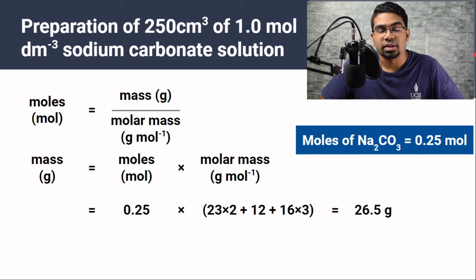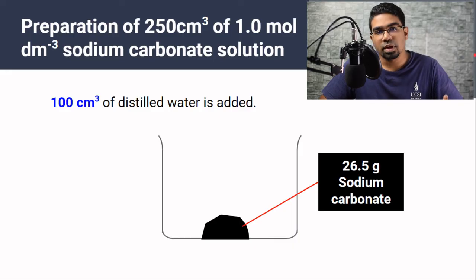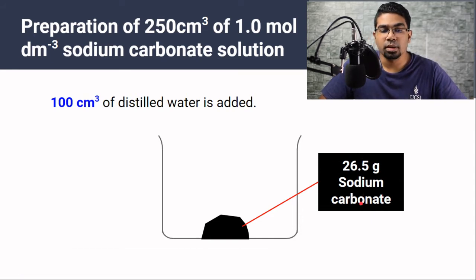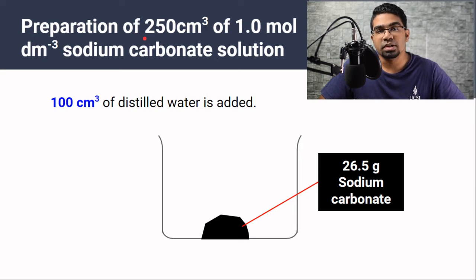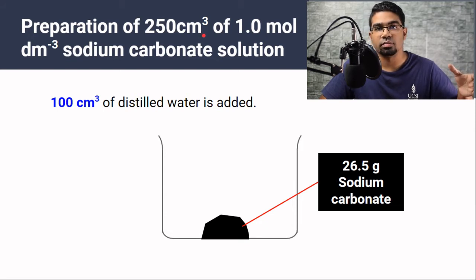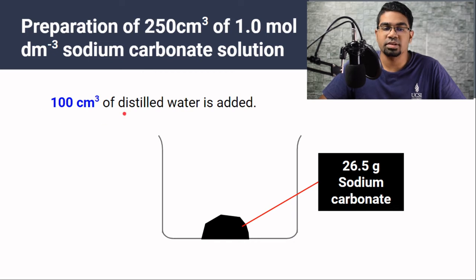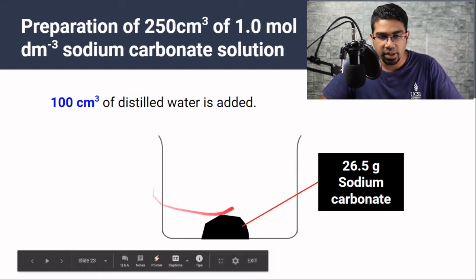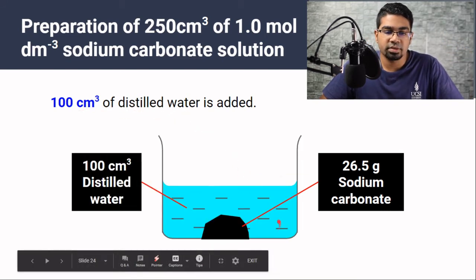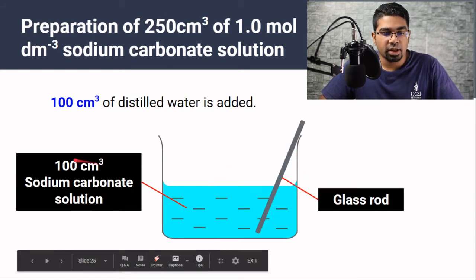Now we can go to the method. This method of preparation is by dissolving solid in a solvent. We need to weigh exactly 26.5 grams of sodium carbonate. The final volume we want is 250 cm³, but initially when we dissolve, we don't use 250 cm³ — instead we use about 100 cm³ of distilled water, which doesn't need to be accurate. We add the distilled water, stir with a glass rod, and get roughly 100 cm³ of sodium carbonate solution.